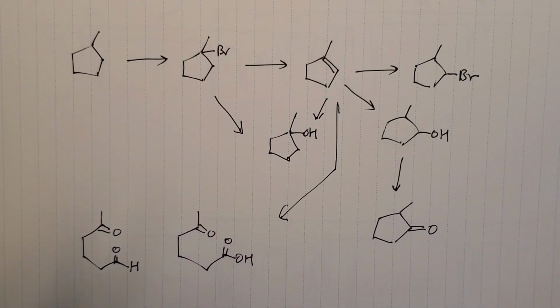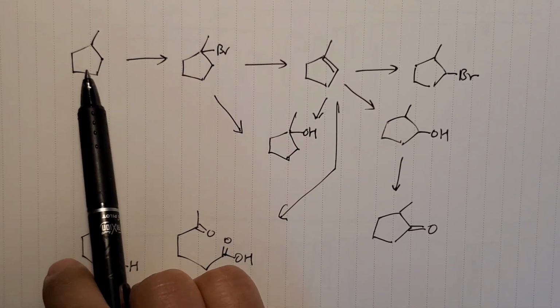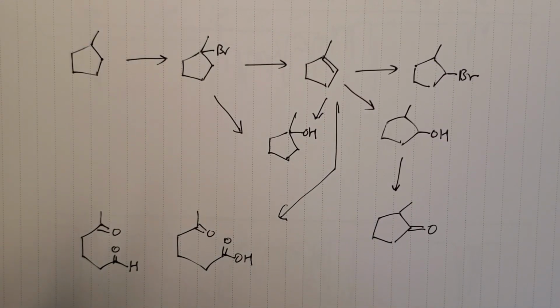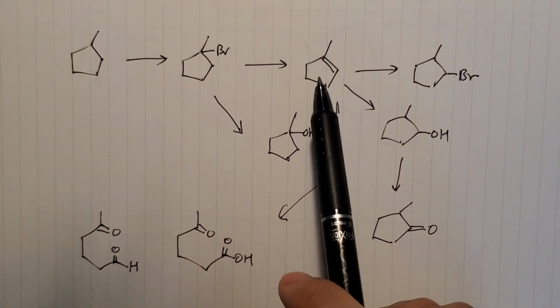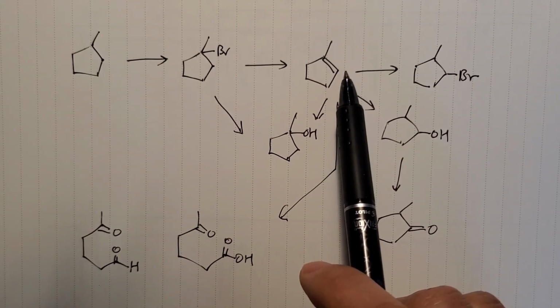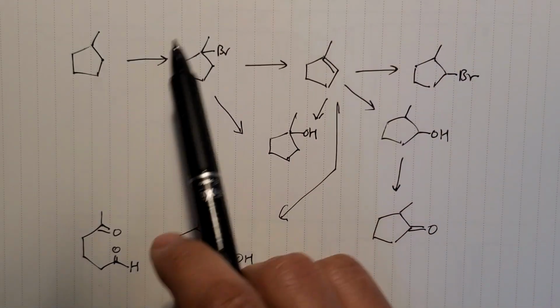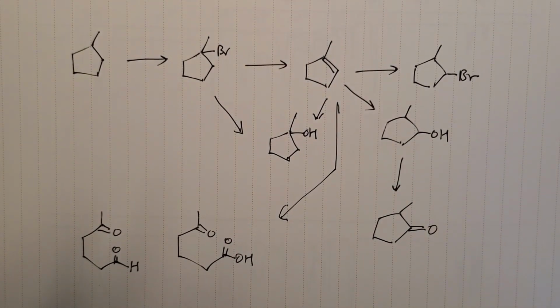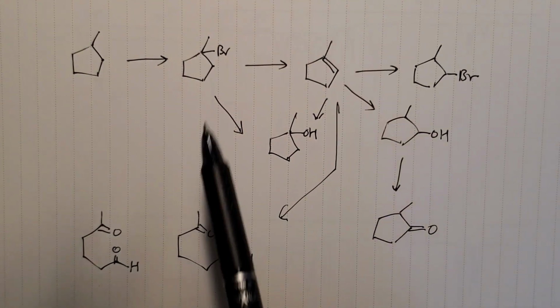So we can monitor all these reactions we could do from here to there. We can check the C-Br peaks coming around 600 to 700 reciprocal centimeter, and you can check the double bond. This double bond around 1600 to 1450 or CH over 3000. And again, this will be similar to that. There's no way you can separate them with IR, so you need to go based on the NMR.